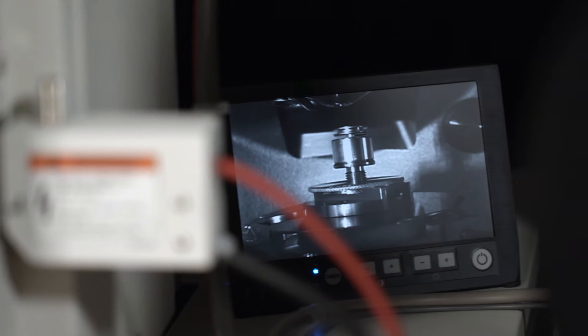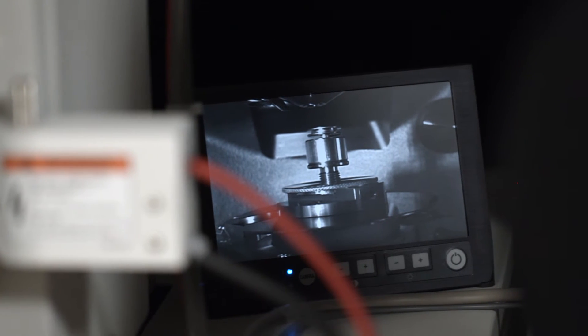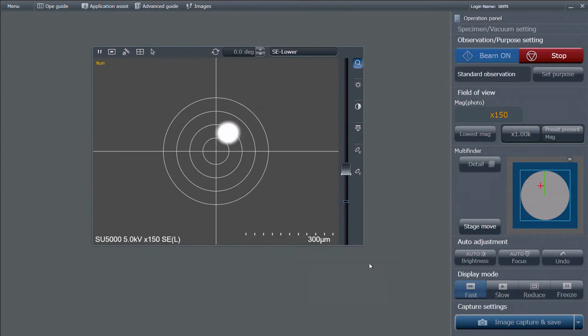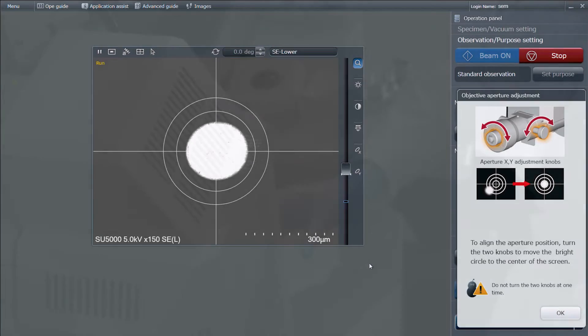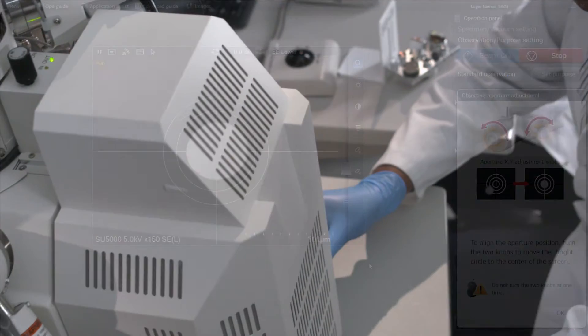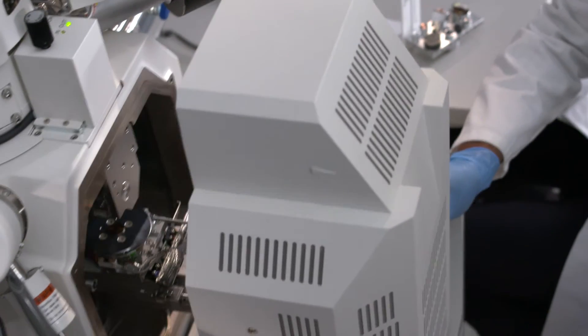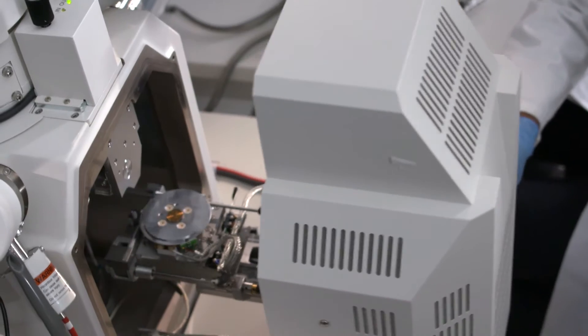Changing the beam spot intensity in the SU-5000 is related to an aperture position. Our unique EM-Wizard software guides the user to the proper aperture position in real-time during sample observation.